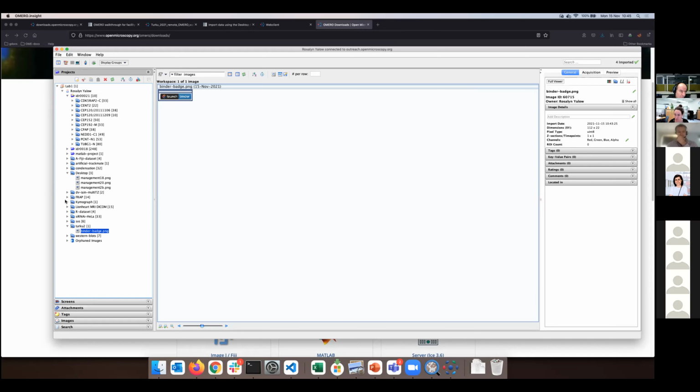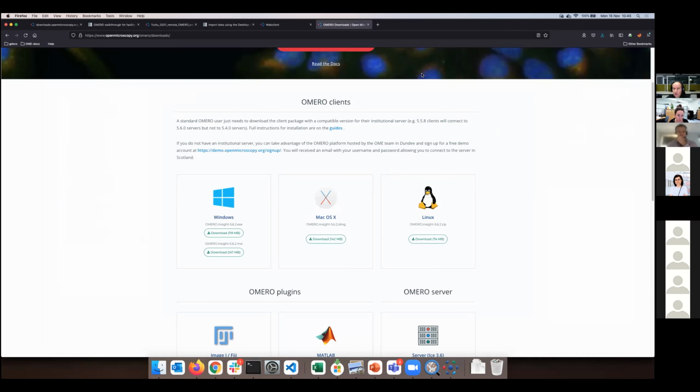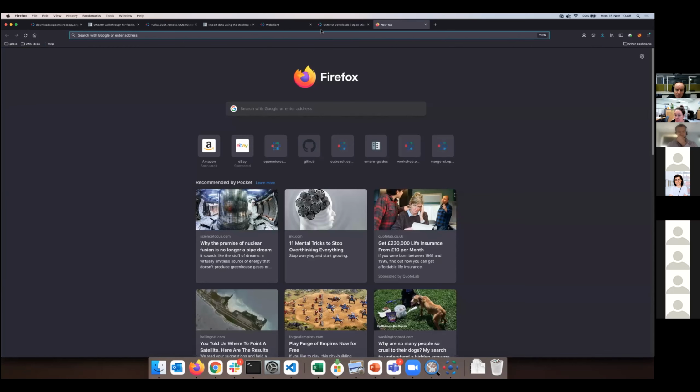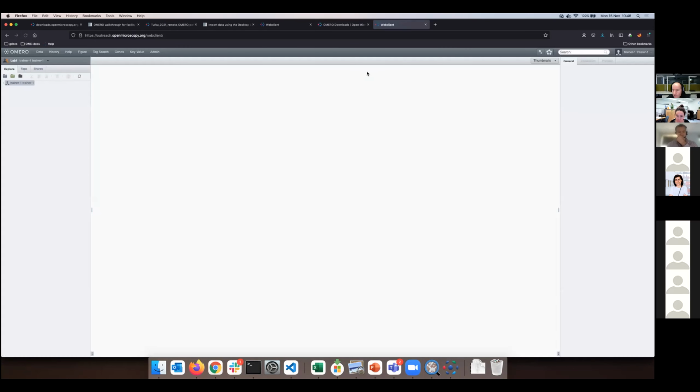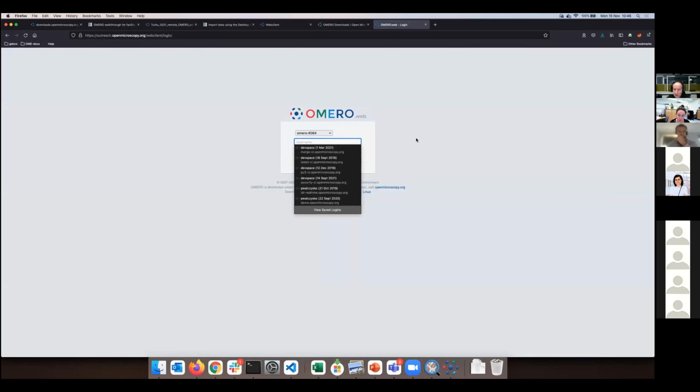Okay, and you will find out for yourself, please, how to use it. So this is, we imported using Omero Insight. Now, just again, raise your voice if you didn't manage to import. If you are confused by the import workflow, you should not be confused at this moment. You should be able to understand what happened here in front of you. That's actually pretty crucial. How could you import and how will you import your data into Omero?